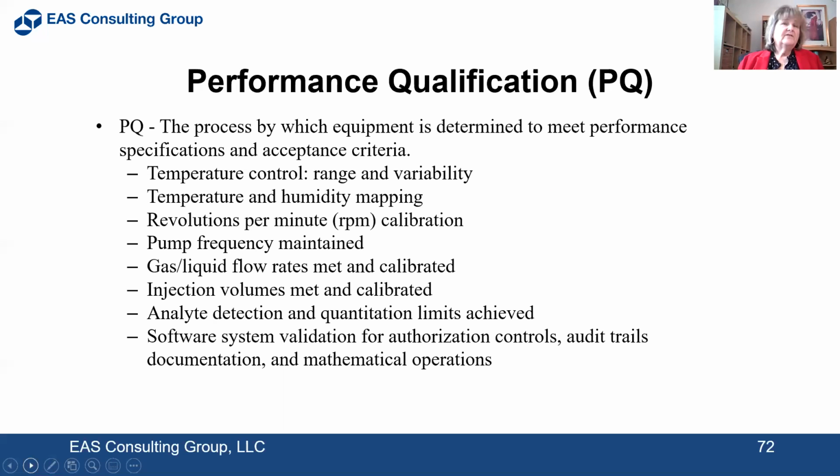Your performance qualification, your PQ, is where all your measurements are and where everything gets very detailed. Your PQ is a process by which equipment is determined to meet performance specifications and acceptance criteria. So if it has temperature control, like a refrigerator or freezer, you're going to see what that range is, how much it varies.